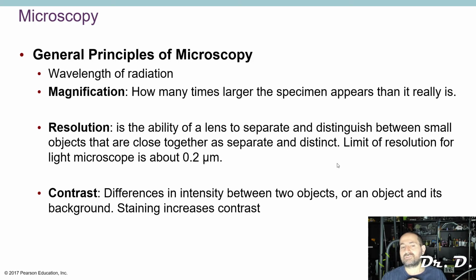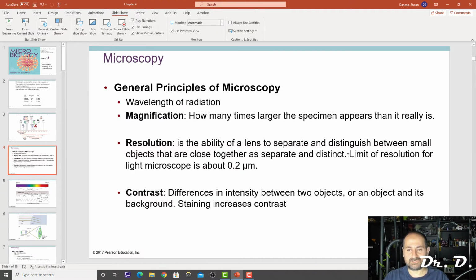So the closer the two tiny dots can get to one another, the better your resolution is. And remember what I told you the resolution limit of your eyeball is? That's right, 0.2 micrometers. If two tiny dots are closer than 0.2 micrometers, which means, oh, this is actually the light microscope. Yeah, this didn't look right to me. Let me show you something.